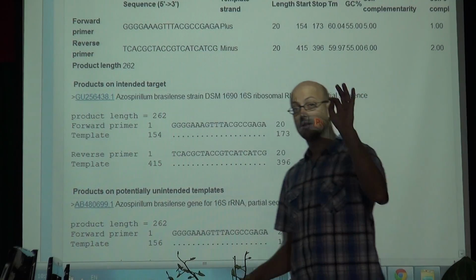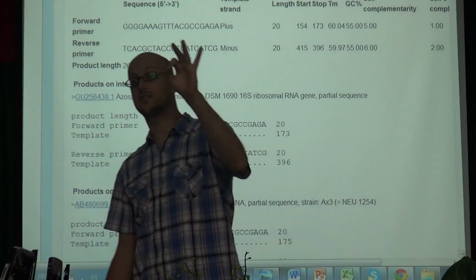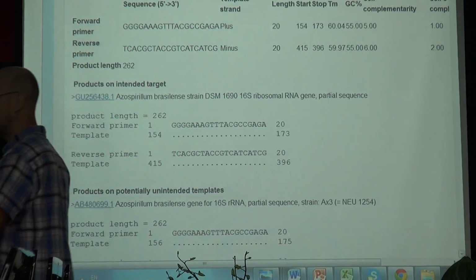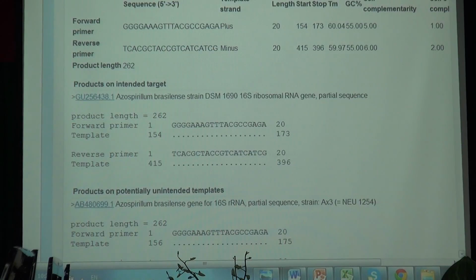Okay. The last thing we need to check is the specificity. How specific is the primers?